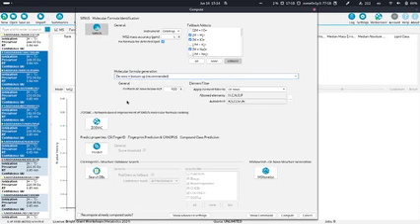Maybe just a few words about the new bottom-up search. It's based on the Buddy paper. And the idea there is that we know that our structured databases are not complete, and there are a lot of molecular formulas missing. But if you take a structured database and also consider a lot of biotransformations or neutral losses and extend the database this way, then we can assume that we probably consider 99% or even 99.99% of the molecular formulas. And that's basically the idea here.